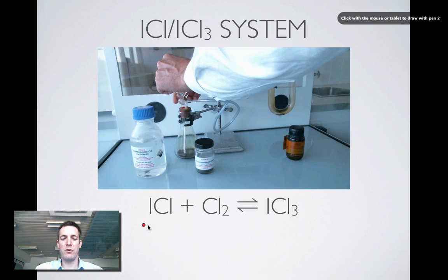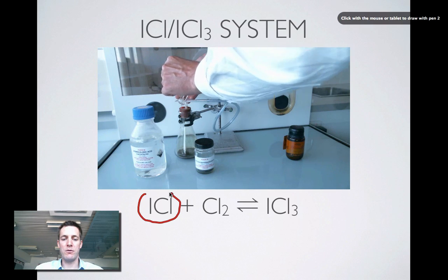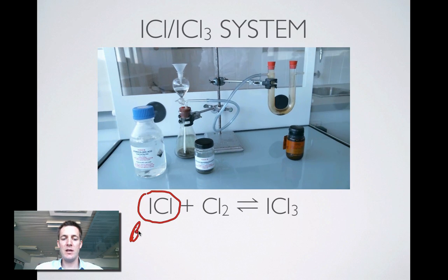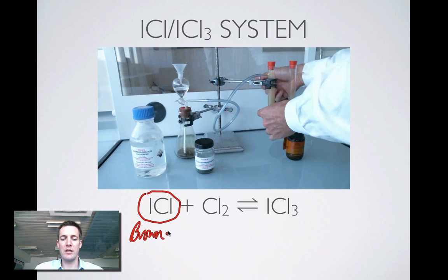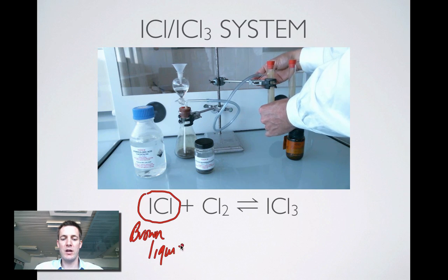So we're going to be forming ICL first of all. How can we tell that we've formed some ICL? Well, it's a brown liquid. So if we see brown liquid in the U-tube on the right, we know we've got ICL there.